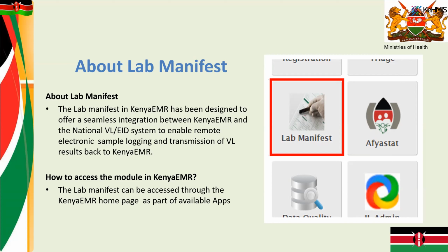This application can be accessed by going to Kenya EMR, then locating the homepage. One of those apps is written as Lab Manifest. So that is where the module is found.